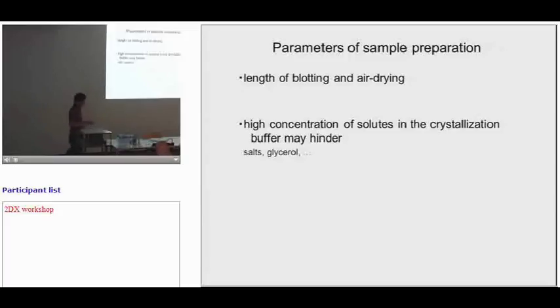So I usually use them at low concentration in the embedding medium solution. Alternatively, sample preparation at 4 degrees may help because it is highly humid and evaporation is slow.